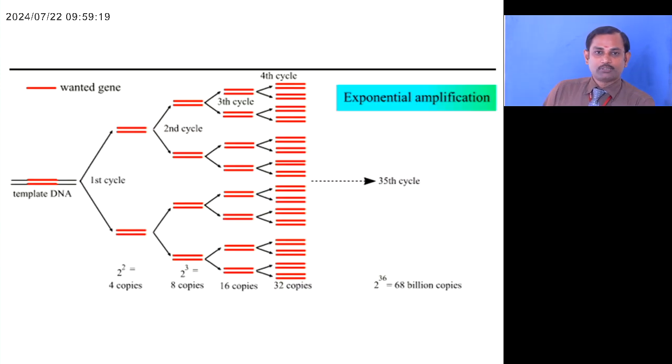So this is the simple explanation of the PCR technique, how it works. When you apply a single copy of DNA, after the completion of all cycles, you will get a larger amount of DNA copies. That is because of the polymerase enzyme and the primer. For example, if you add one copy of DNA and run a PCR, it will give you two copies of DNA.